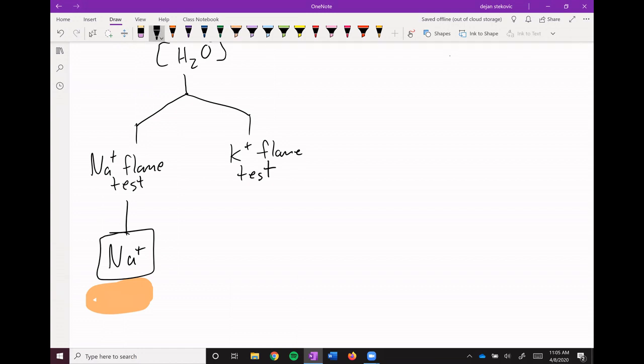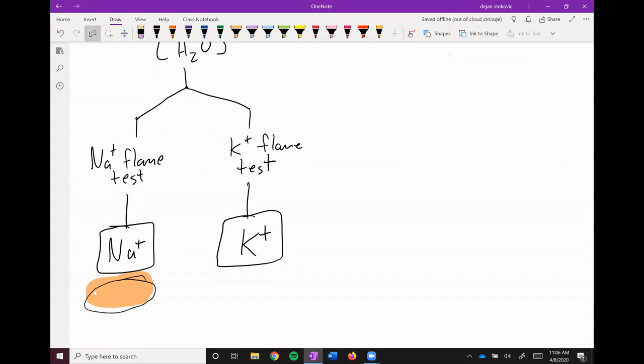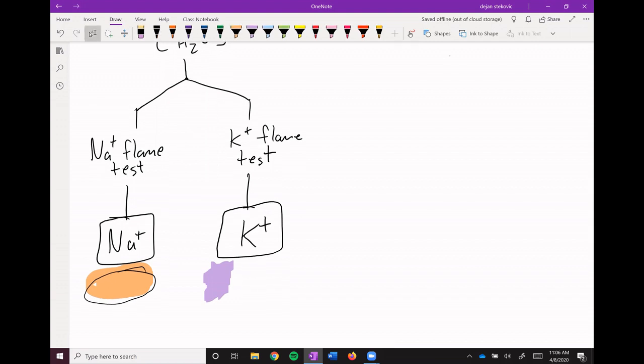And then the potassium one is actually one of the hardest to see. If you try to see it when you have a solution of sodium, this orange is going to block out any of the color. Normally, if you look up some videos, you'll see a purple lavender flame. In this lab, we're going to use a cobalt glass. That's going to block out this yellow flame, and it's actually going to make this violet flame seem more red, more of a red purple color. You'll see I call it lavender in the lab, but it's more of a red color, but that'll determine your presence of potassium.